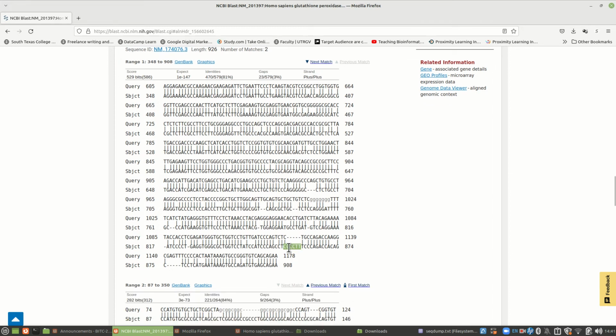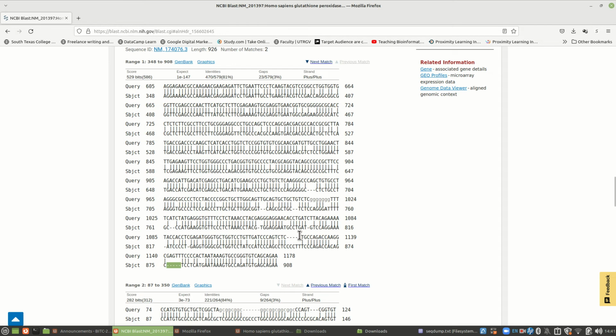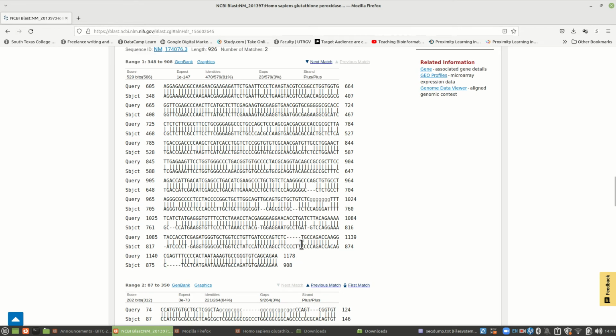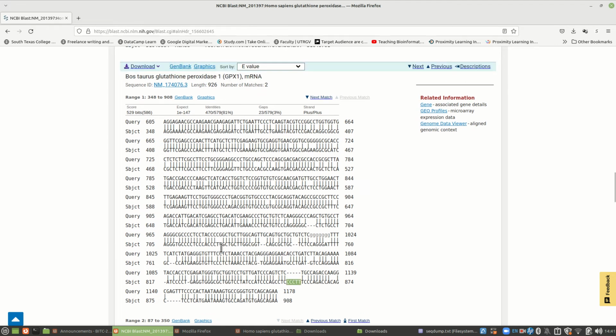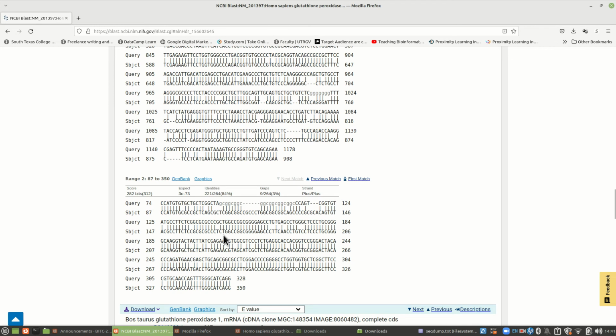There are a couple of sequences here that are missing. Are these perhaps things that might affect a splice site? That's something. Go look and see if the letters are something that has to do with the splicing. Now I know what this one does. This is actually part of this. This implies that there was a transposable element, something called a jumping gene, that jumped into this sequence and altered it, which is really interesting to me. I did not know that.